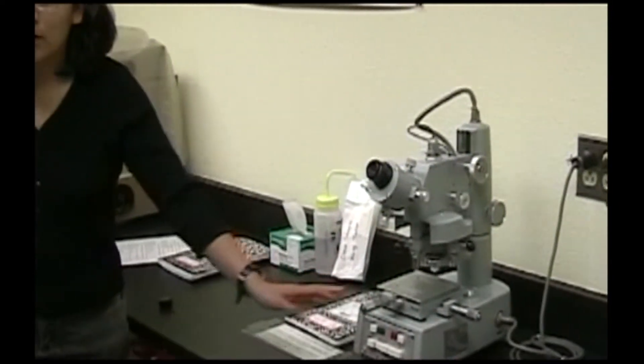We have three micro hardness testers — they all have Vickers indenters. There's the Shimatsu HMV-M, the Leeko M400, and the digital HVS-1000.